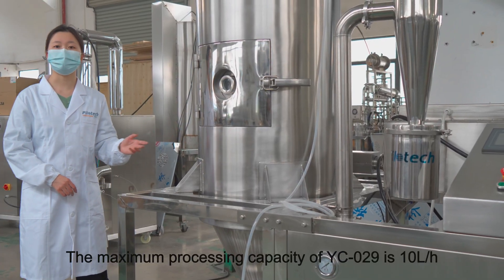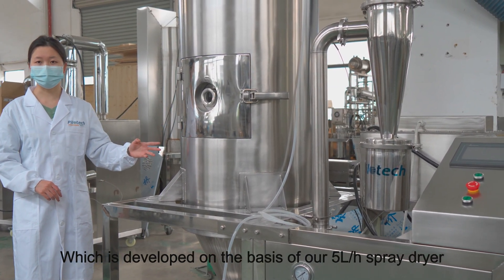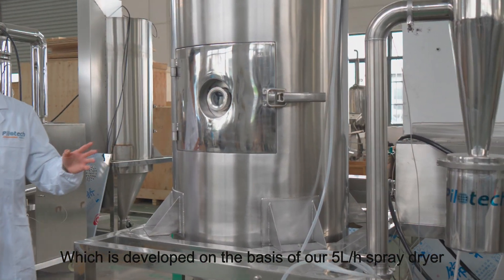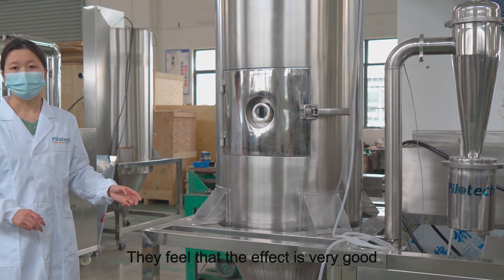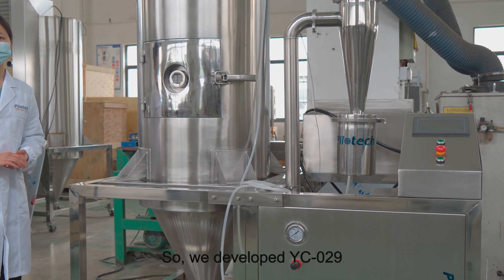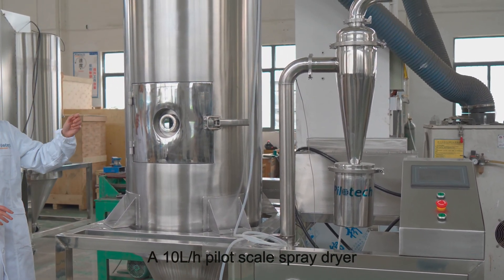The maximum processing capacity of YC029 is 10 liters per hour, which is developed on the basis of our 5 liters per hour spray dryer. After many customers used our 5 liters per hour spray dryer, they felt the effect was very good and wanted to buy larger equipment. So we developed YC029, a 10 liters per hour pilot scale spray dryer.